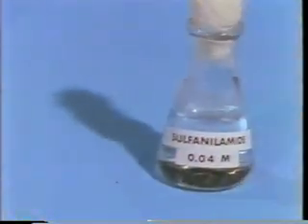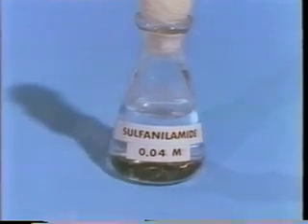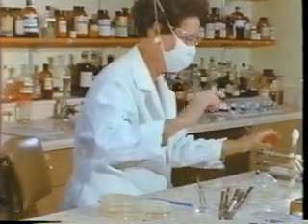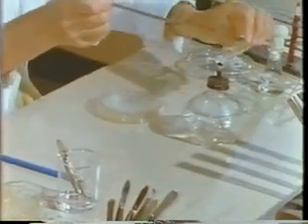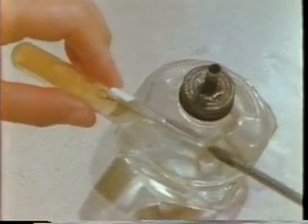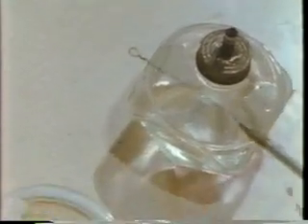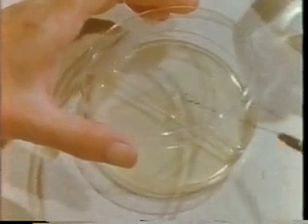One such compound was sulfanilamide. Let's demonstrate the effect of sulfanilamide on bacterial growth. A nutrient medium in a petri dish is used to sustain growth of bacterial organisms. These bacteria, harmful to humans, are carefully transferred from a stock preparation. They are gathered in a wire loop and streaked onto the nutrient medium in both compartments of this dish.